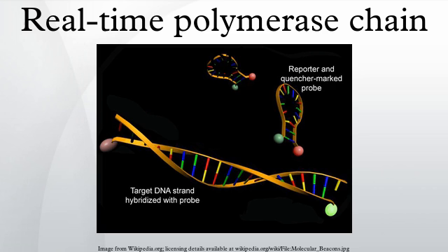Due to the small size of the fragments, the last step is usually omitted in this type of PCR as the enzyme is able to increase their number during the change between the alignment stage and the denaturing stage. In addition, some thermal cyclers add another short temperature phase lasting only a few seconds to each cycle, with a temperature of, for example, 80 degrees Celsius, in order to reduce the noise caused by the presence of primer dimers when a non-specific dye is used.